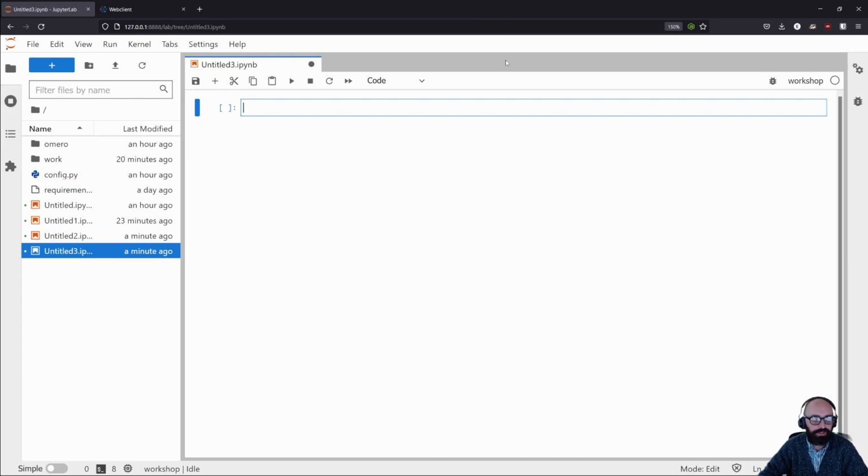Okay, the last part of this workshop is working with regions of interest, or ROIs as I'll probably be calling them. These can be kind of difficult to deal with using the default OMERO API, so we kind of engineered ezomero to make it easier to do some of this stuff.